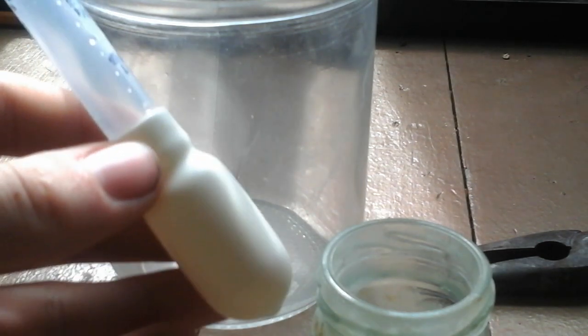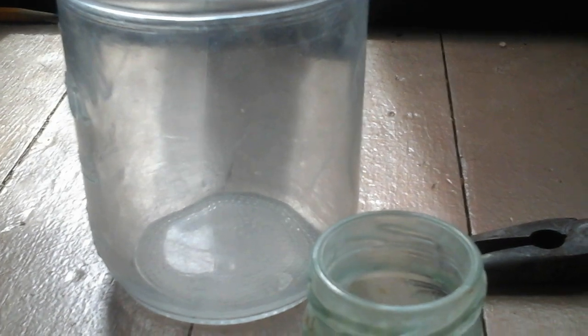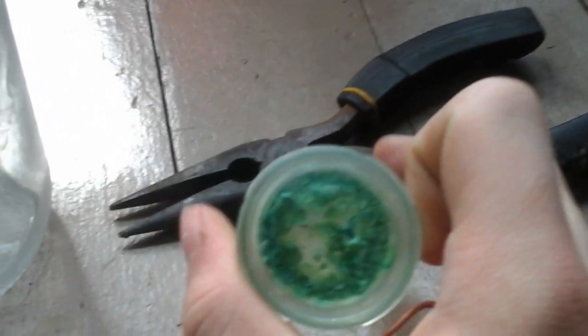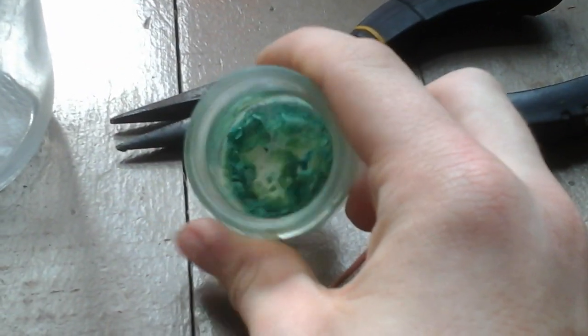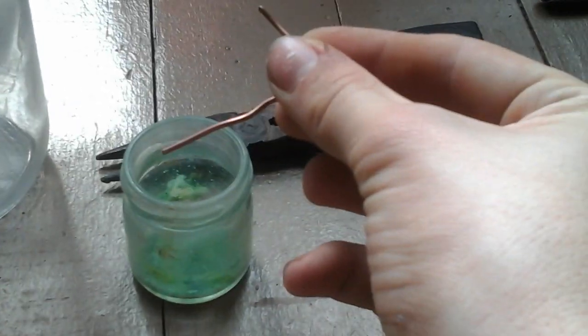I have right here about two milliliters of HCl, and here's the stuff that I made earlier. I don't know if we'll be able to see it react today, but it's bluish green. And here's my copper.